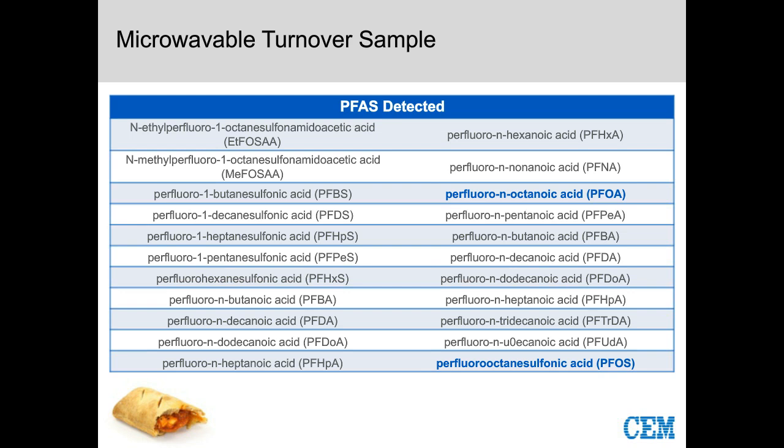So overall, I want to note, this is a beginning study. We're working with some challenging substances here, right? Once we get into these food stuff with all these different components, extraction becomes harder. What I hope you see is that we were able to extract these compounds at the beginning level, but clearly we need to show, moving forward, spike values so we get good recoveries and RSD values. But I feel that the EDGE is going to be very applicable to all of these samples and beyond. So with that, I want to conclude.